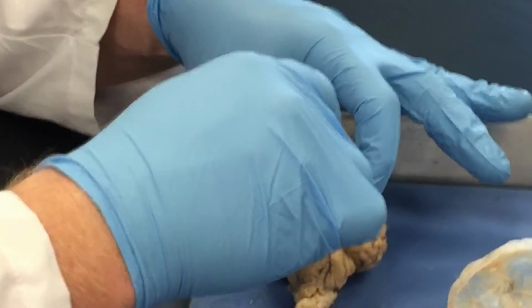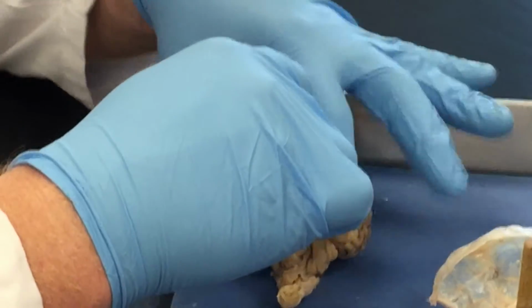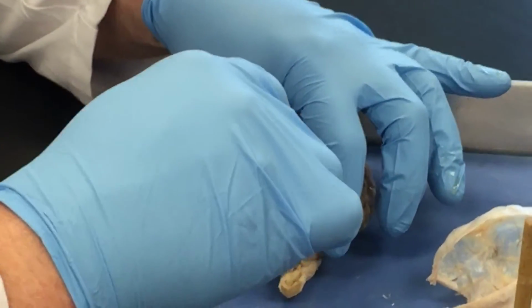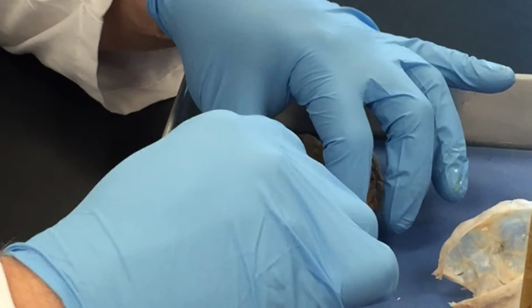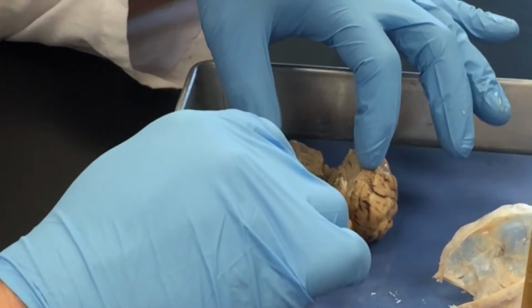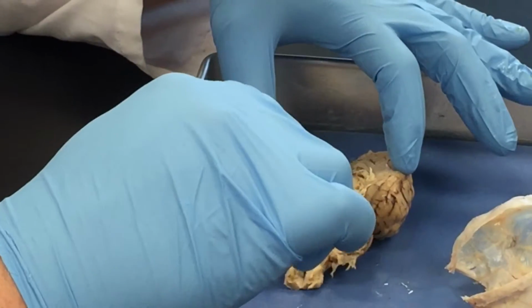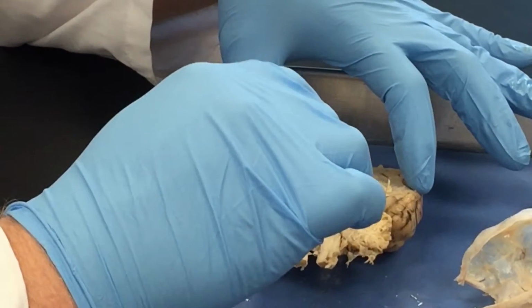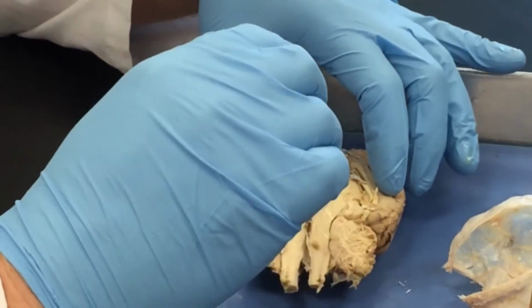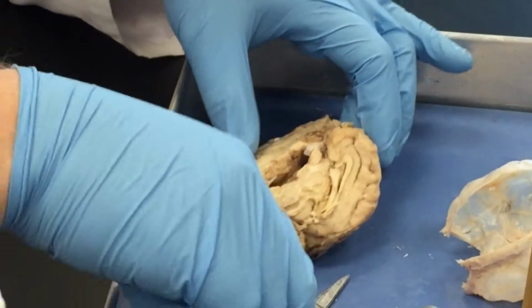So we're just going to cut this sagittally right down the middle. And we'll go all the way down through the cerebellum and the brainstem and spinal cord. Okay. A little bit of dura mater is going to be a pain in the butt.